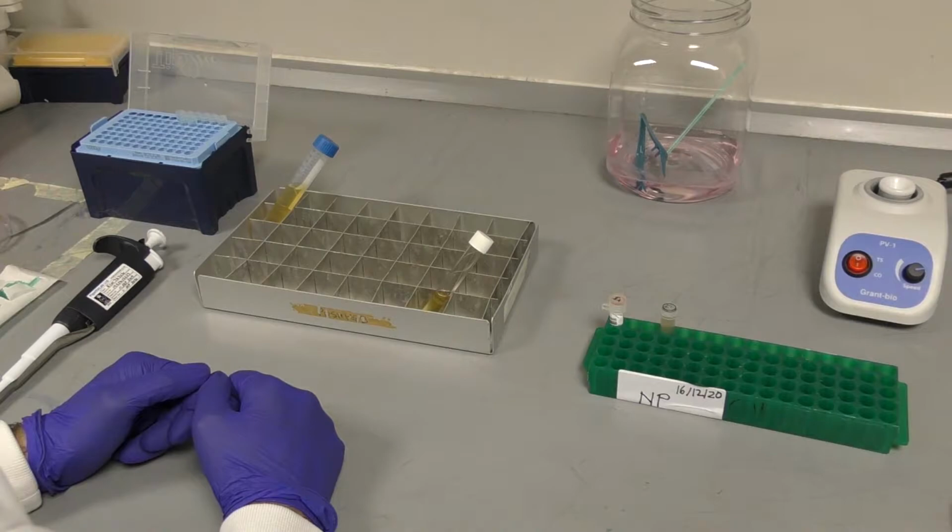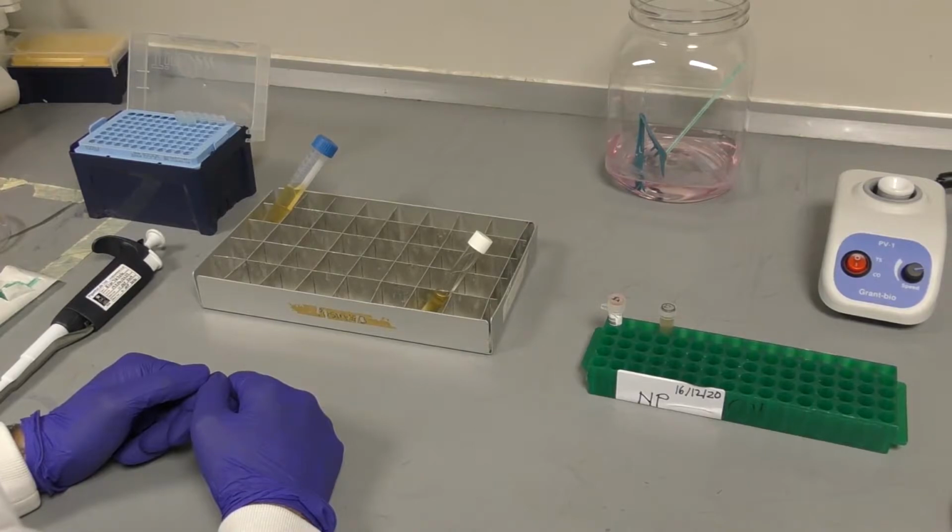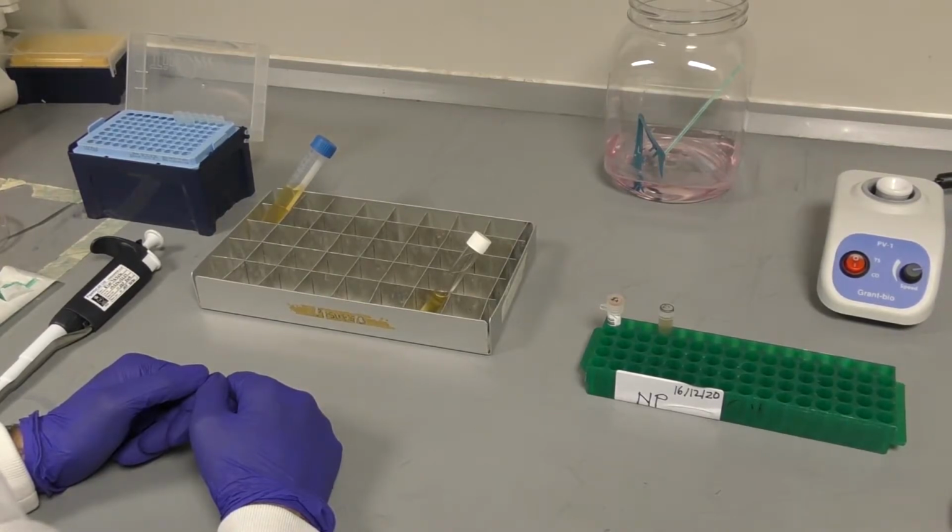Firstly, processing nasopharyngeal samples. Your nasopharyngeal vial 5 STGG aliquot may be stored at -80 degrees or in the fridge at 2 to 8 degrees. This will need to be brought to room temperature prior to plating. You also need to bring to room temperature your culture plates, rabbit/sheep serum, and Todd Hewitt broth.